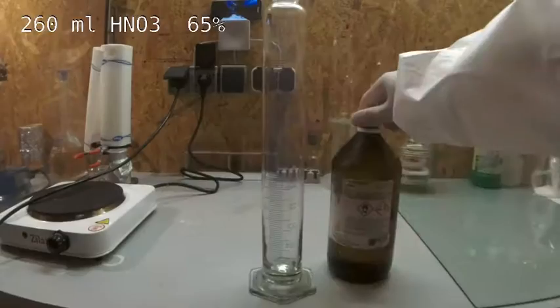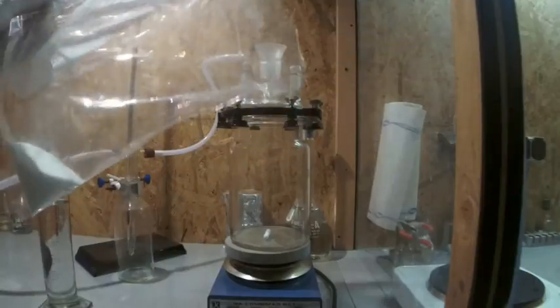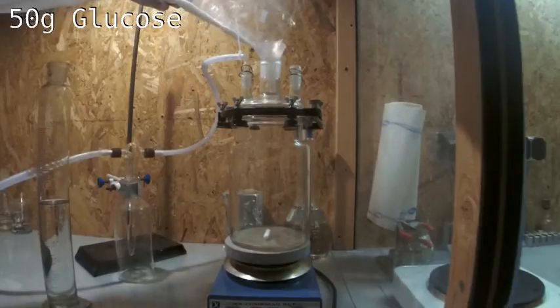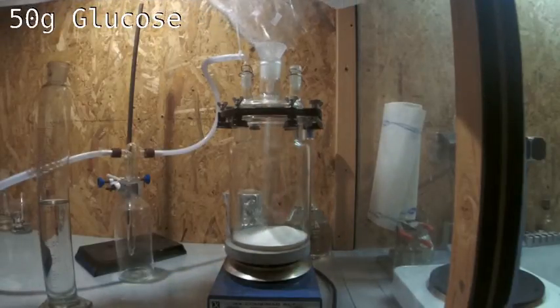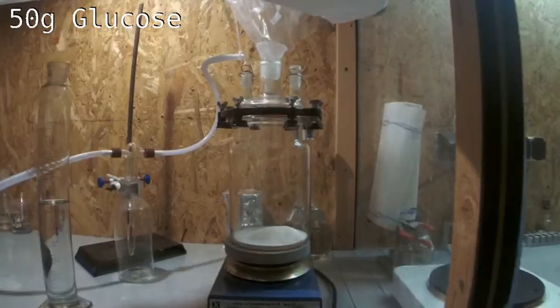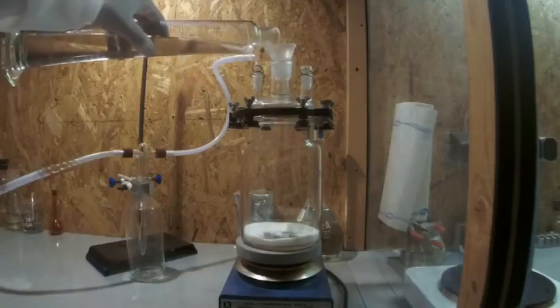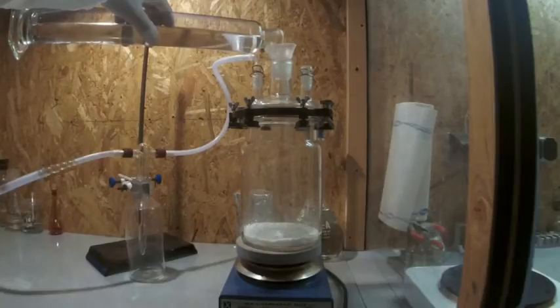But this was not working like I expected it to do. I measured 260 milliliters of 65% nitric acid out. Then I filled 50 grams of glucose in the reaction vessel. The vessel had an empty security wash bottle and a gas wash bottle filled with water attached to it. The water then absorbs the nitrogen oxides and turns them into nitric acid, which then can be purified.